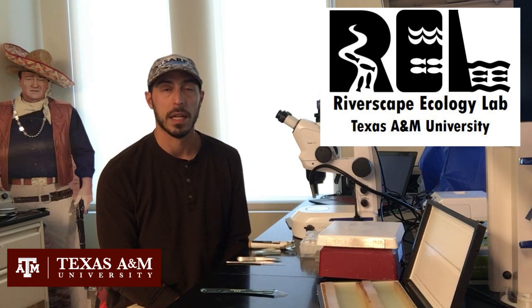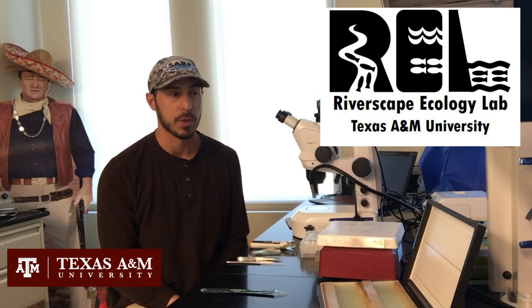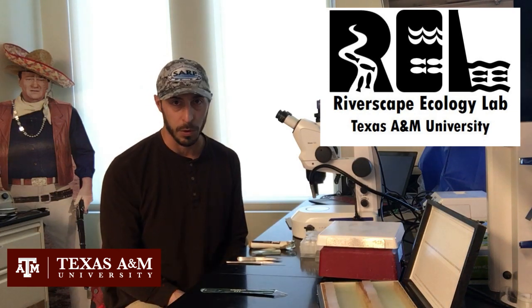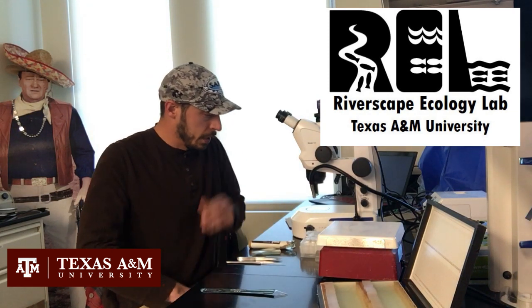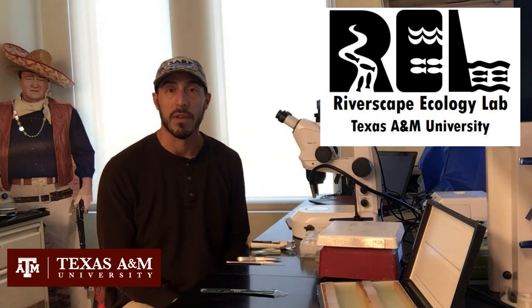Hey there, if you stumbled across this video, my name is Dr. Aker. I've got five or six years experience working with adult otoliths, but I've recently taken the dive into juvenile and larval otolith extraction, which is a whole new world, it turns out. So I decided to make this video as I didn't find anything when I was trying to find some resources.